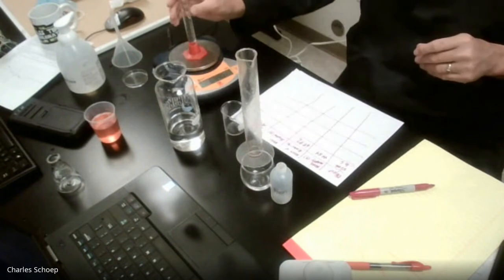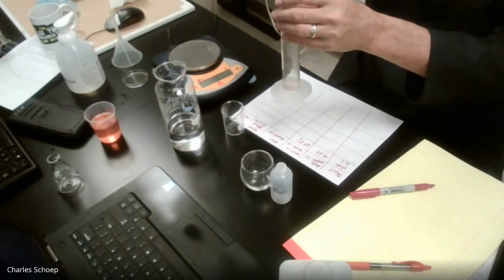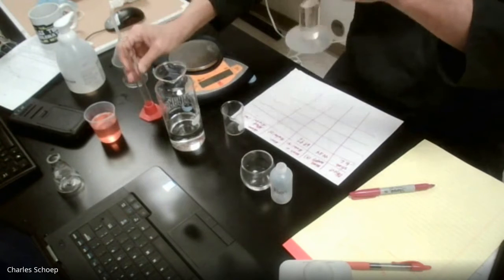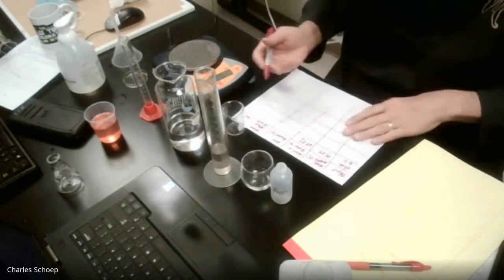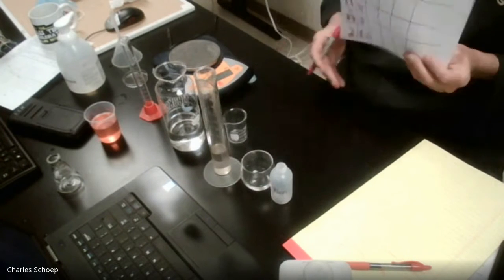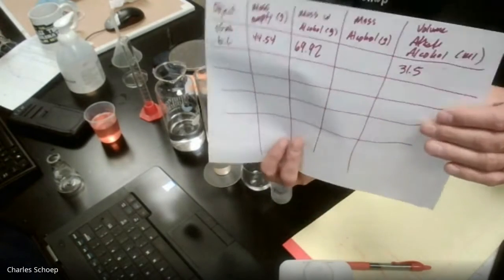Get that really good and empty. And the volume is 31.5 milliliters. All right, 31.5. So there is our first set of data.